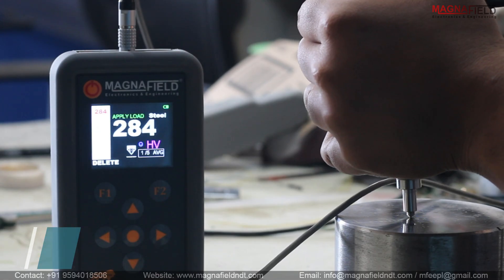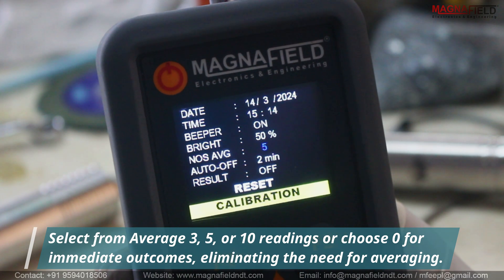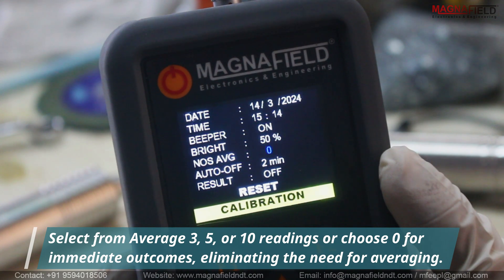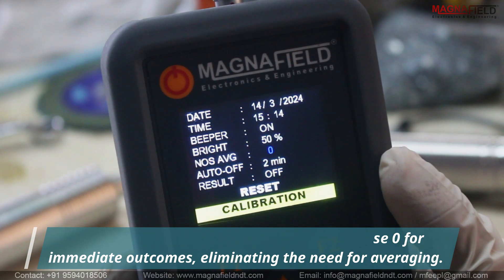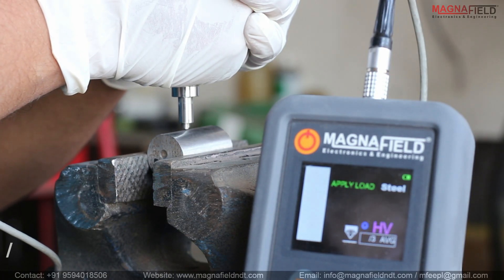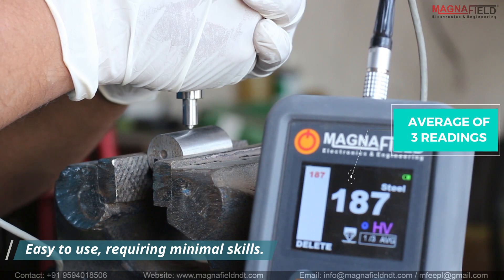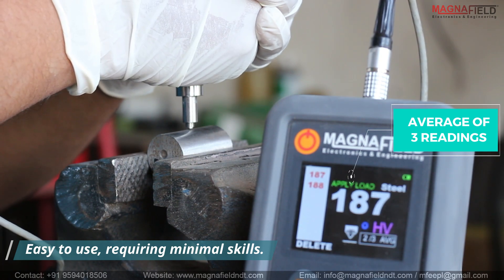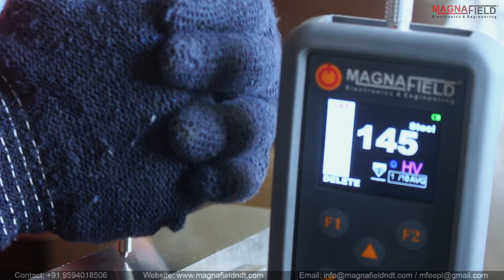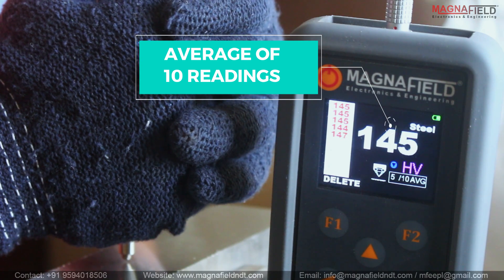In the HU10, you can view average value results. Choose from three, five, or ten readings to view your average result value. Or, you can opt for the zero reading option — the direct output option for immediate access to outcomes without the need for averaging. Operating the HU10 is remarkably user-friendly, requiring minimal skill compared to other hardness testers, while still delivering highly accurate results. Here, the user is taking ten readings effortlessly to achieve an average result, demonstrating the accuracy clearly.